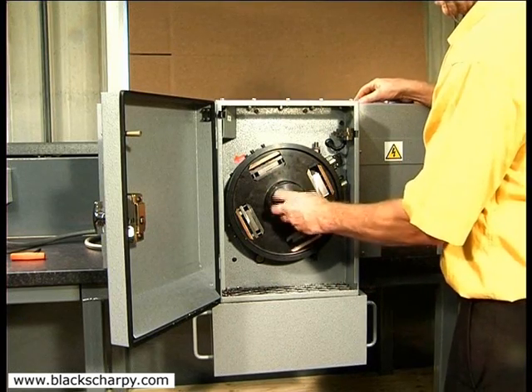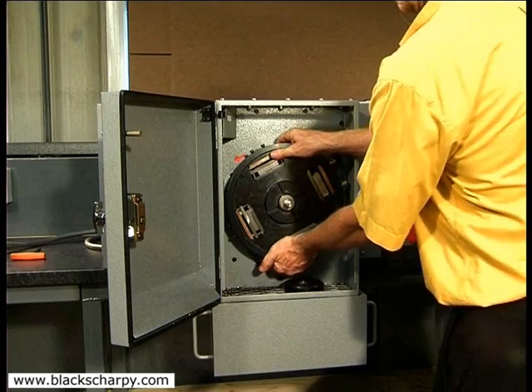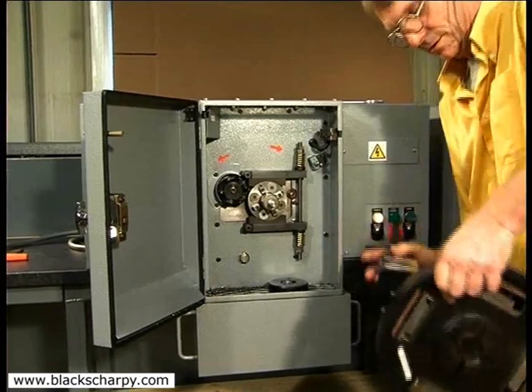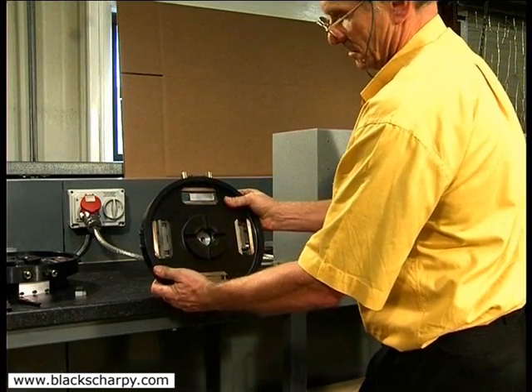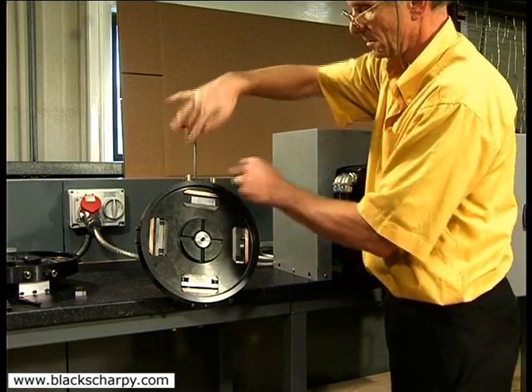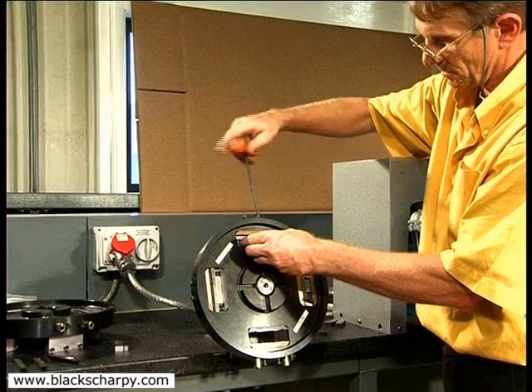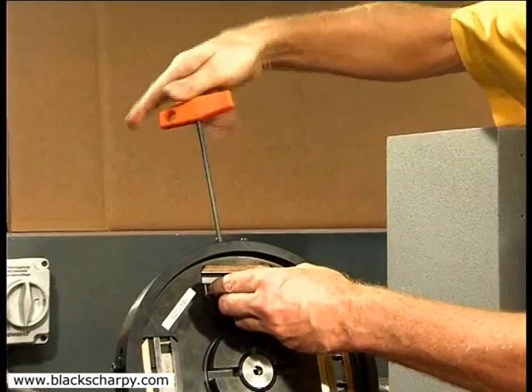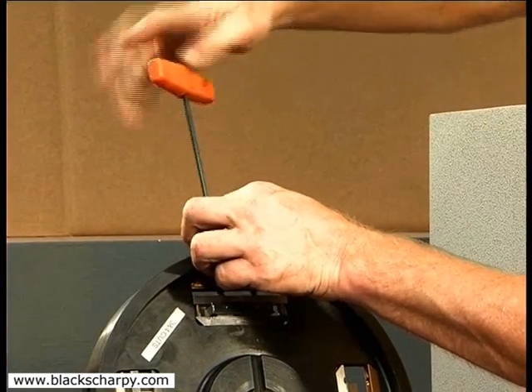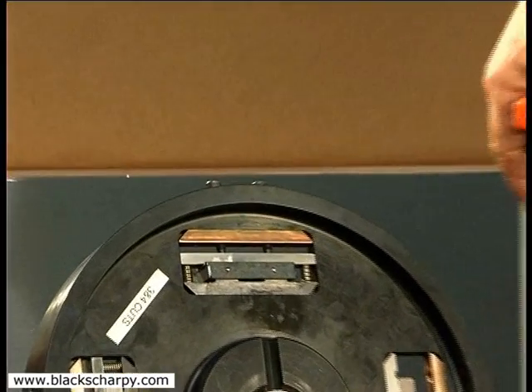Remove the fixture from the machine and place on the special stand provided. Remove the two specimens from the first and second cut pockets and the two dummy specimens from the third and fourth pockets. Now turn the two samples through 90 degrees and secure in the third and fourth pockets. Note the previously machined surfaces are now the clamped faces. Secure the dummy specimens into the first and second pockets.